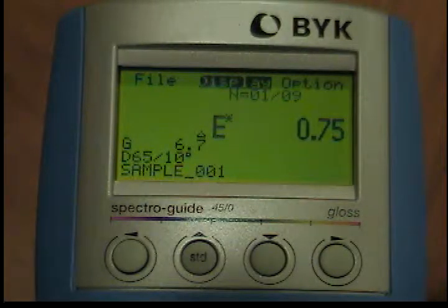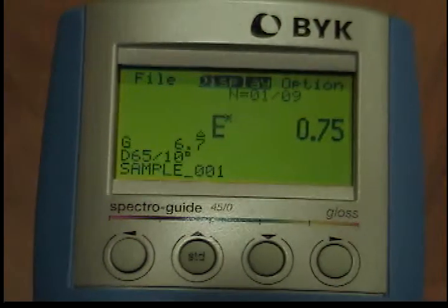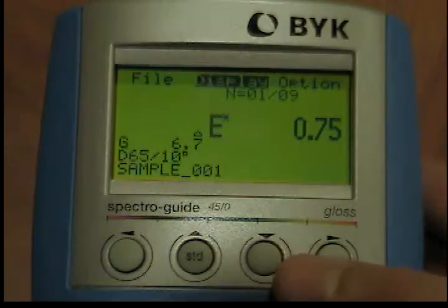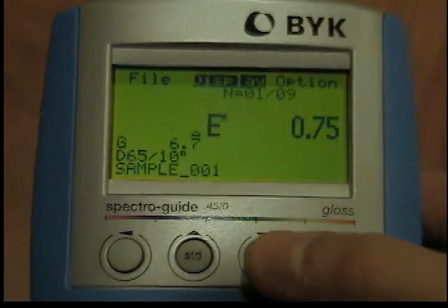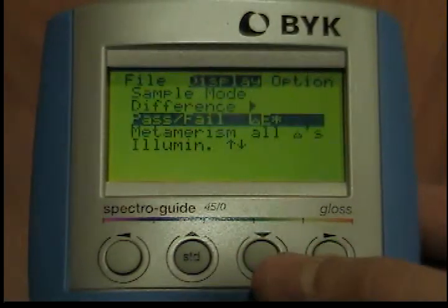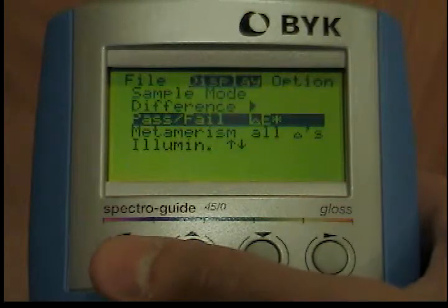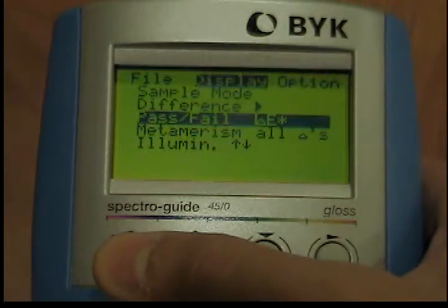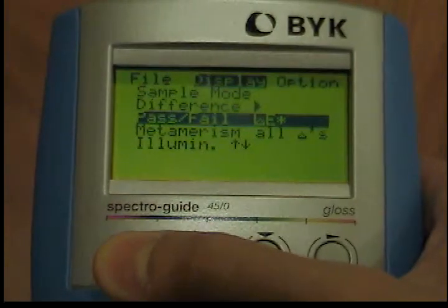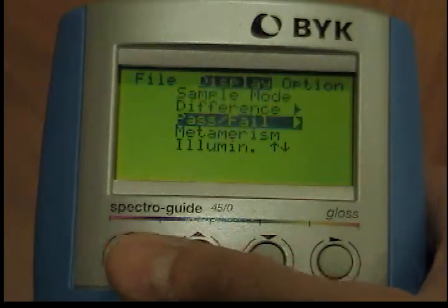If the setting of individual components is selected in the configuration, the expanded input screen also appears and you can enter a gloss range when gloss measurement is activated. When you are finished with this input, you can begin measuring. To do this, press the operate button. The display will contain the differences between these measurements and the selected standard, as well as a message indicating pass or fail.